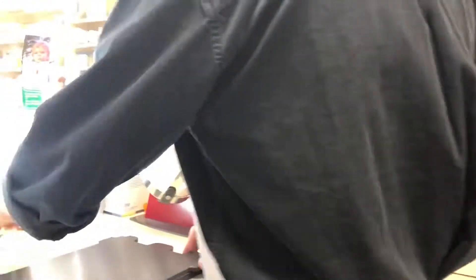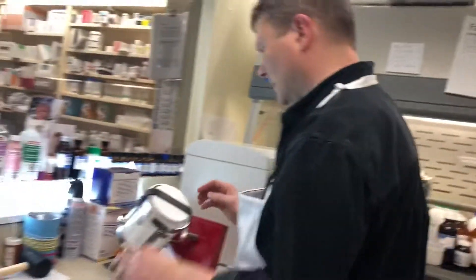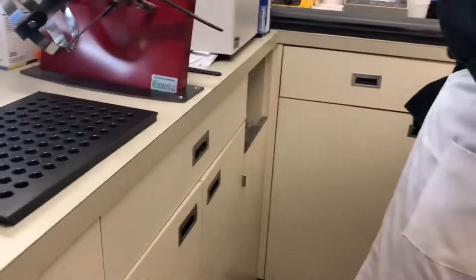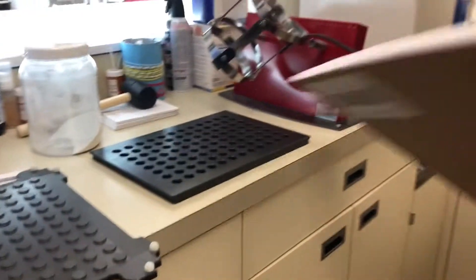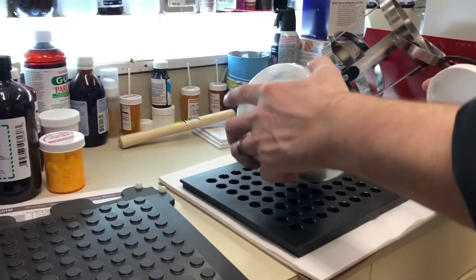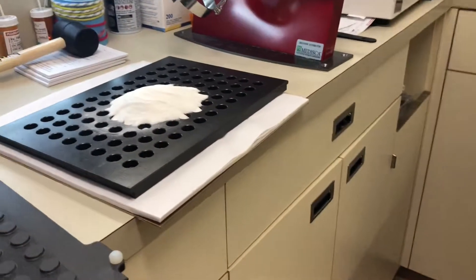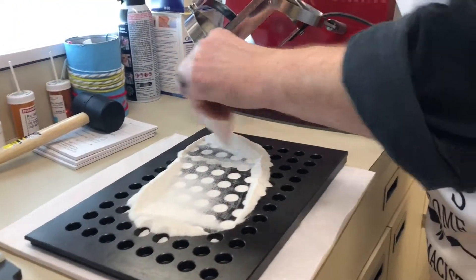Now our mold consists of two metal plates. These are the cups that will receive the active ingredient, and those will be pushed down with the other plate. Let's pour that on there and spread it across to fill all those holes right to the top.